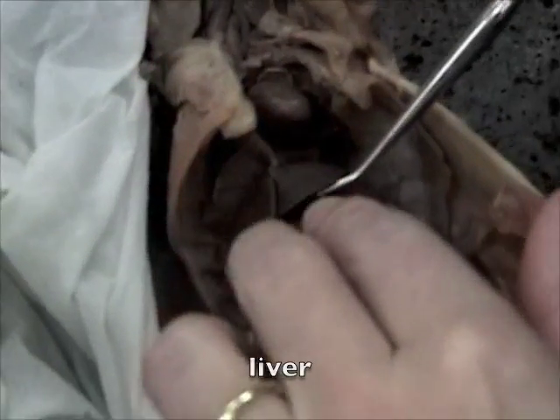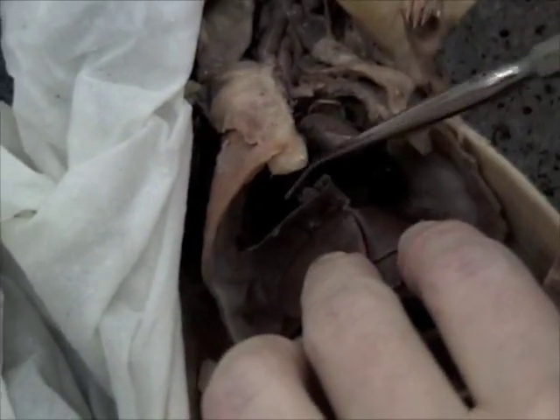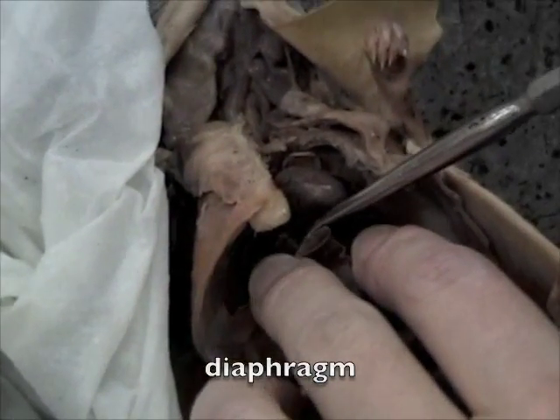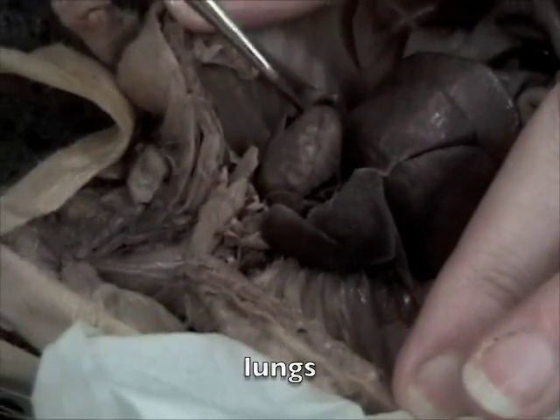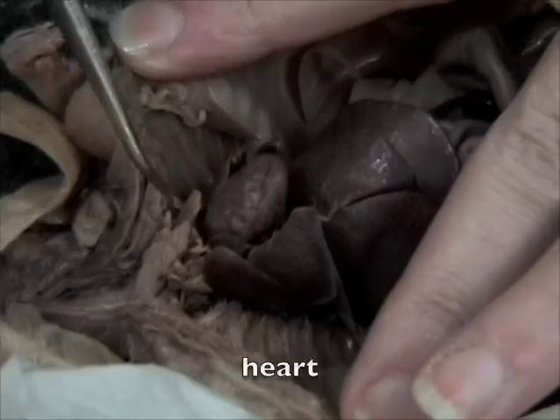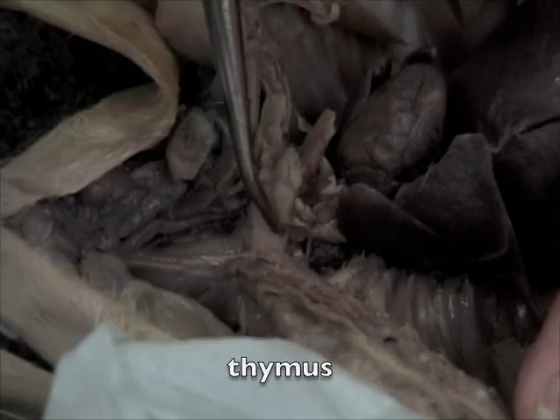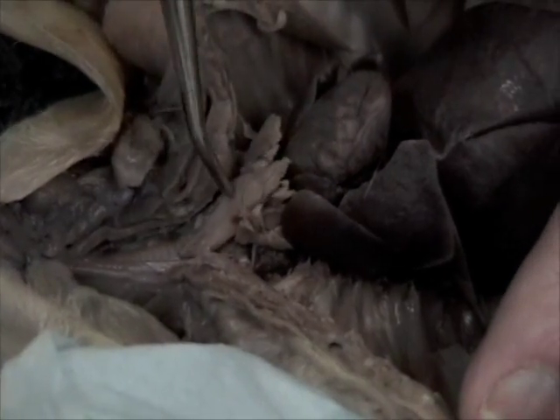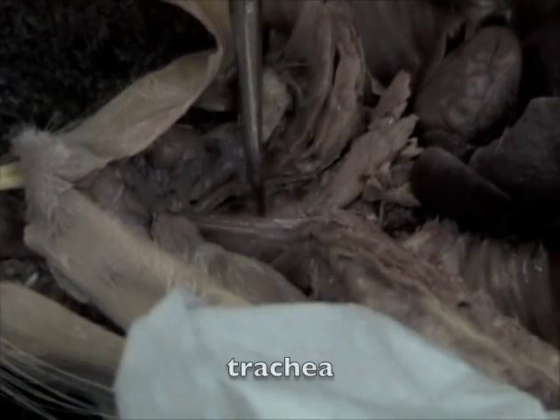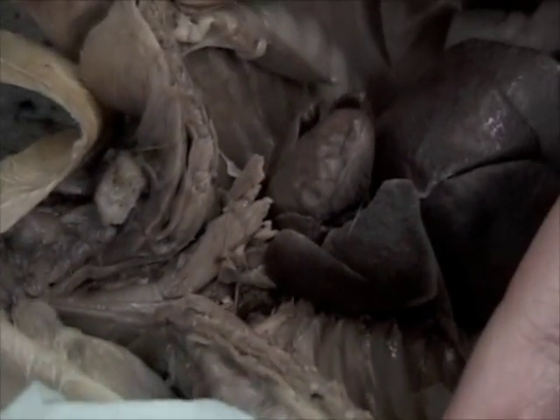The liver, the different lobes of the liver. This tissue that's been cut through is the diaphragm. The lungs, the lobes of the lung, the heart, the thymus right here. The thymus is one of the immune glands, like the spleen. And the trachea right here. In here you can see the ribs of course.